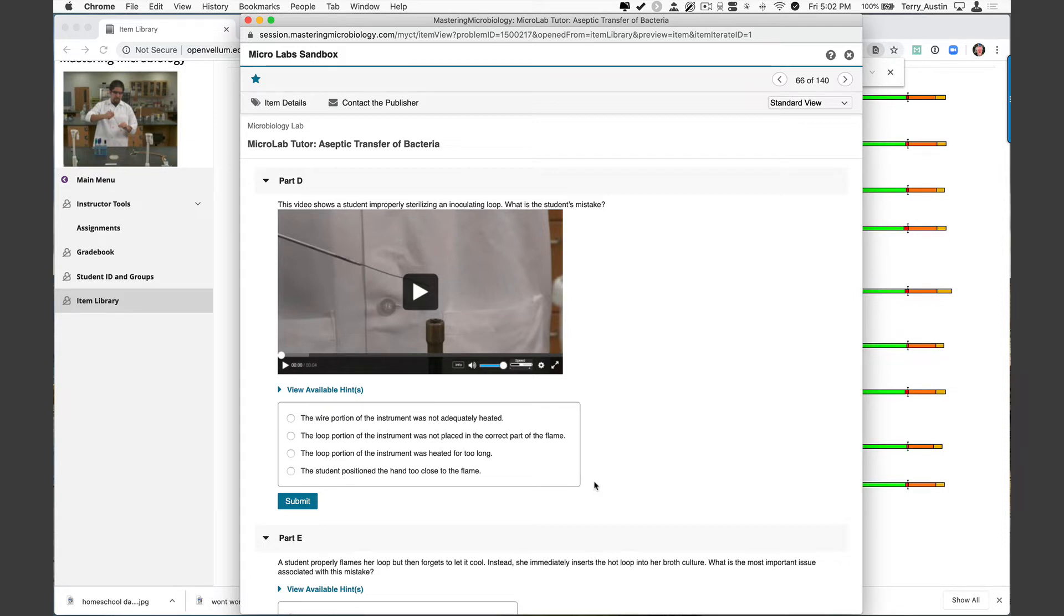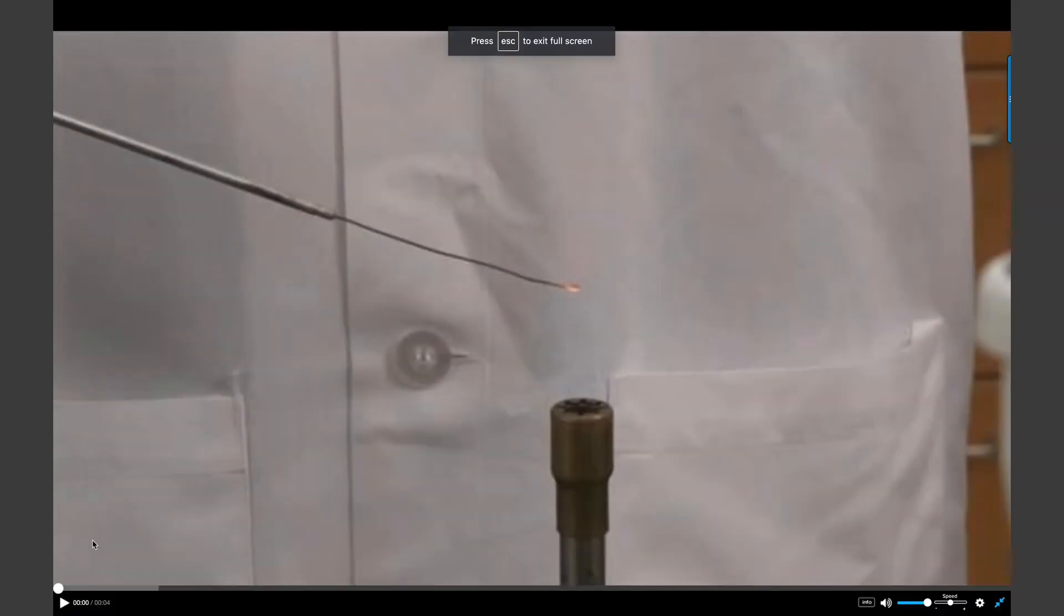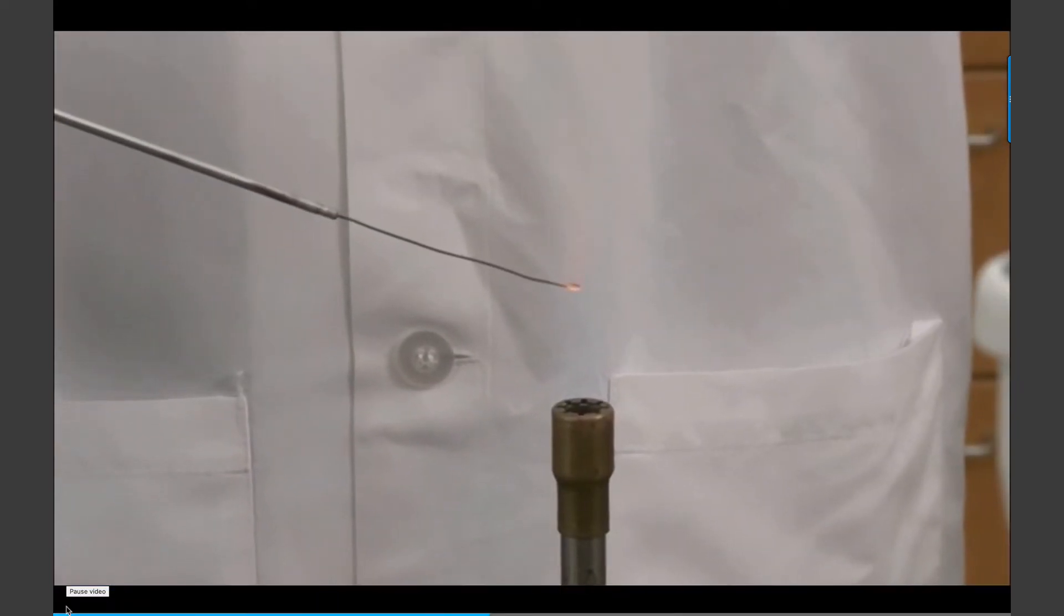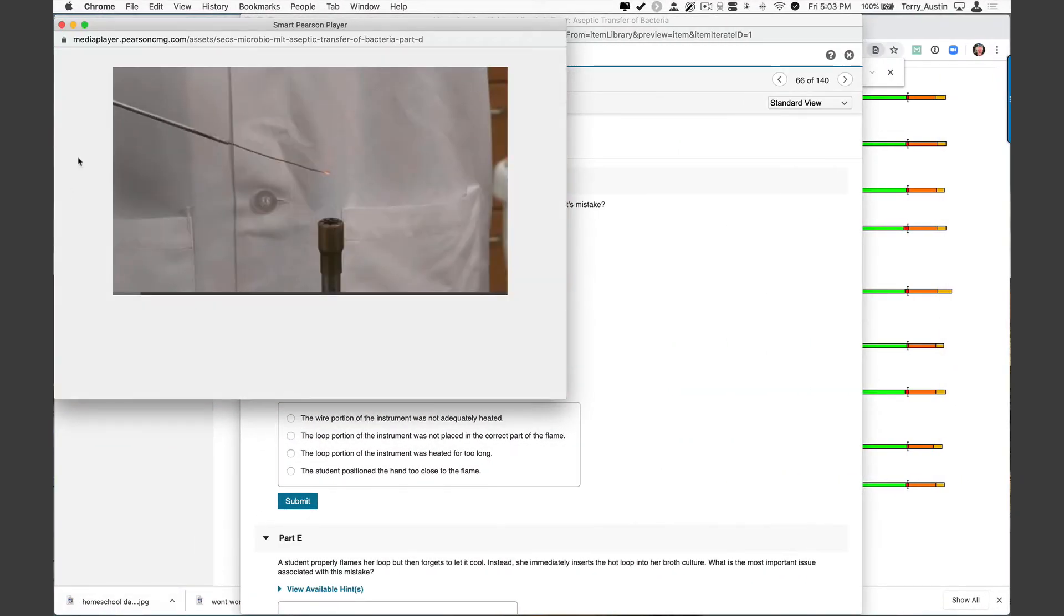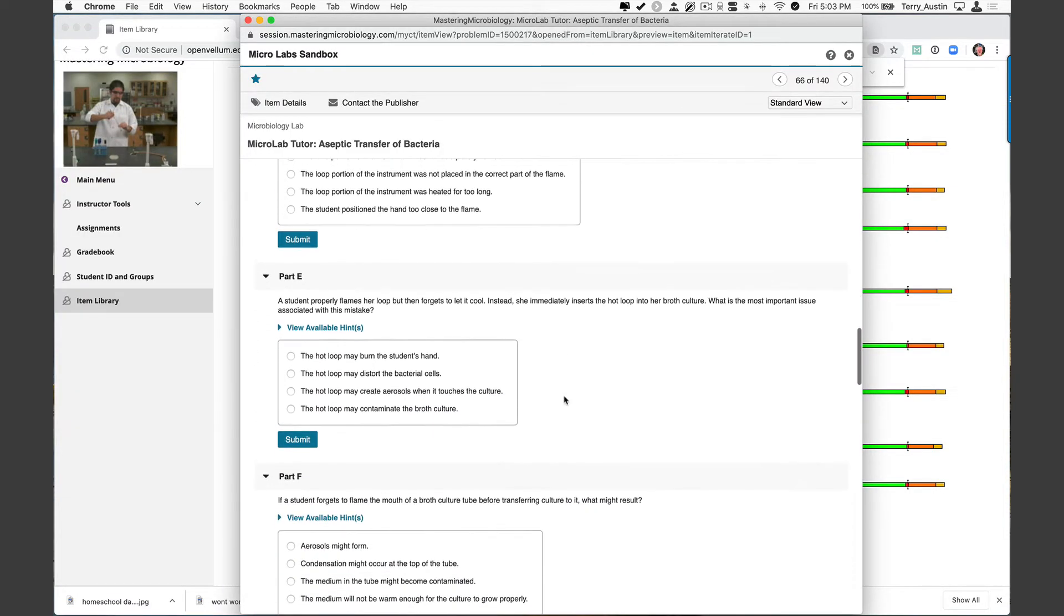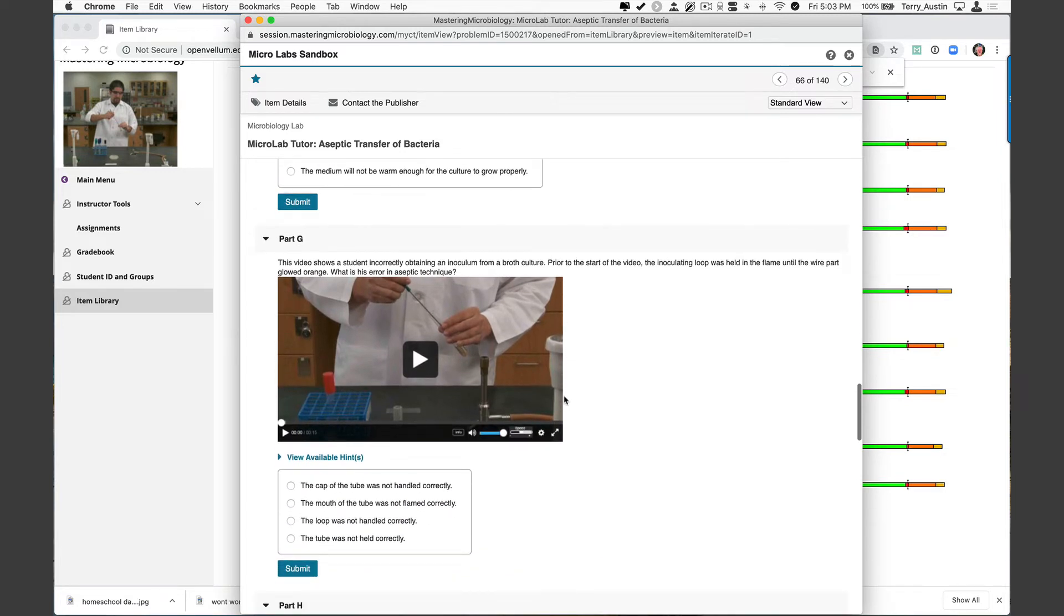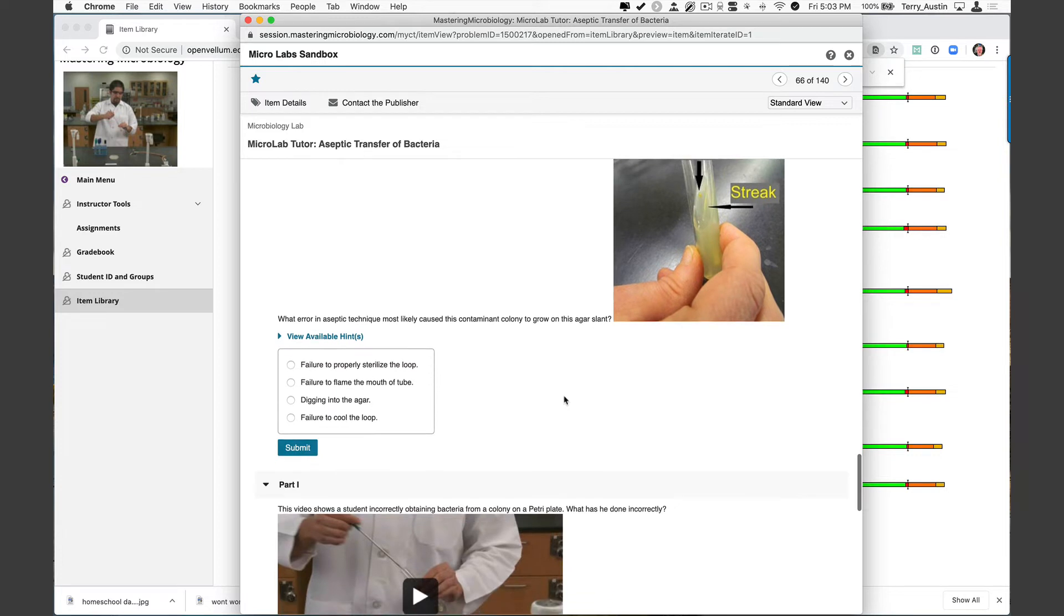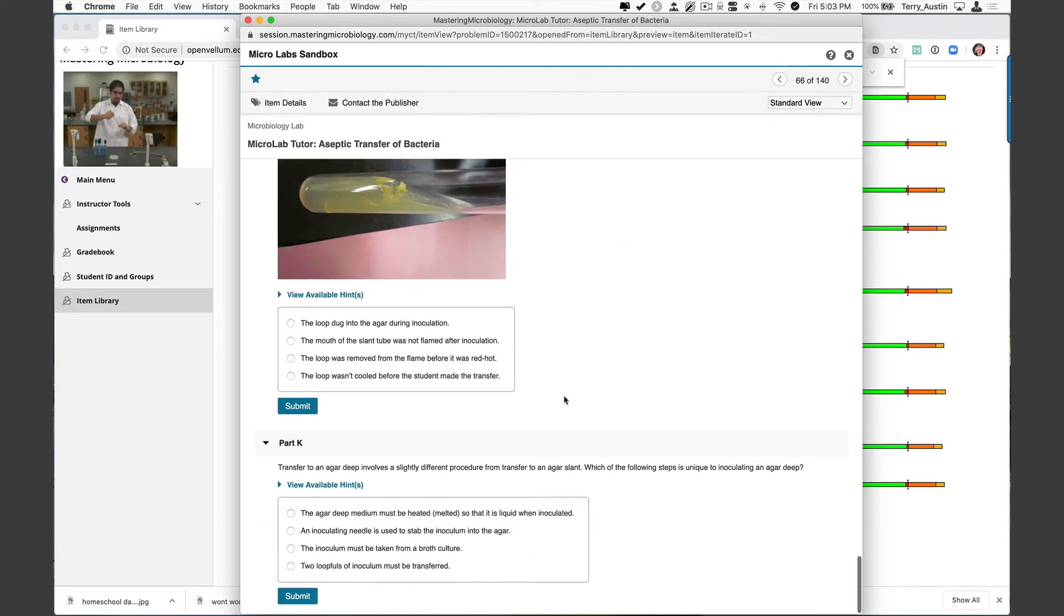This part D, this video says the student is improperly sterilizing an inoculating loop. What is their mistake? And we've got some possible replies at the bottom. Let's watch this. Many of you have seen this particular error time and time again. Let's just watch this really short video. It's about four seconds long. I'll play the whole thing for you. Yeah, we've all seen that error more times than we care to count. And this is the micro lab tutor's way of checking that. We move on. We have more questions, more questions. Here's another video check to make sure they've really understood. And yet another in that same vein. So I think you can see these are really quite robust in making sure your students really understand these key concepts like aseptic transfer.